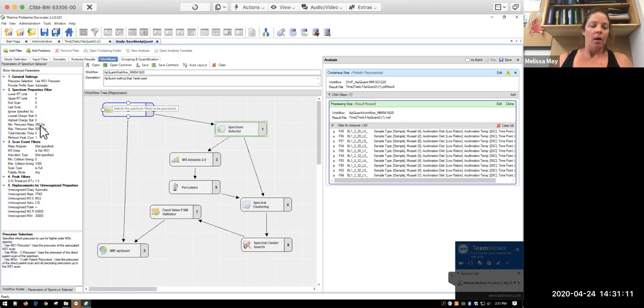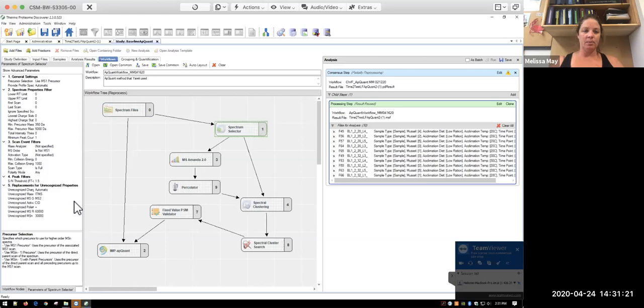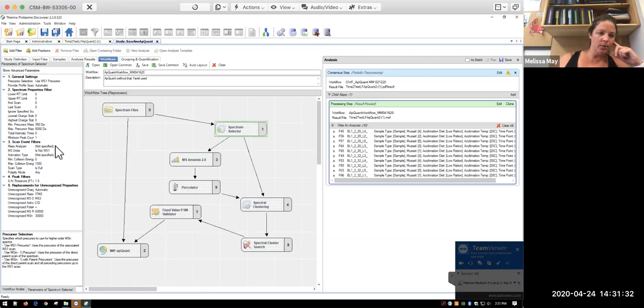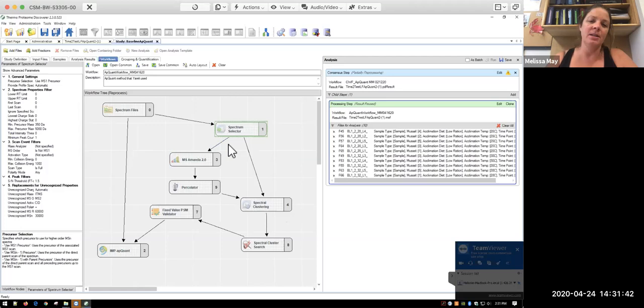We have set here, these are all default. So you could change them if you wanted to. So our minimum precursor mass is going to be 350 Daltons. The maximum is going to be 5,000 Daltons. You can, again, change this if you're looking for something in particular. You can set where your mass analyzer and all of this are. But none of it really matters for the processing. So these are all just kind of default parameters.